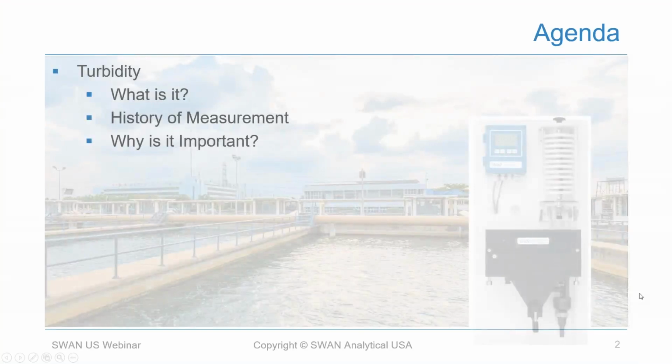So first, we're going to talk about turbidity. I'm going to talk about what it is, give you a little bit of history of the measurement, and we'll talk about why it's important. I'm going to cover the measurement principle that manufacturers use to monitor turbidity.